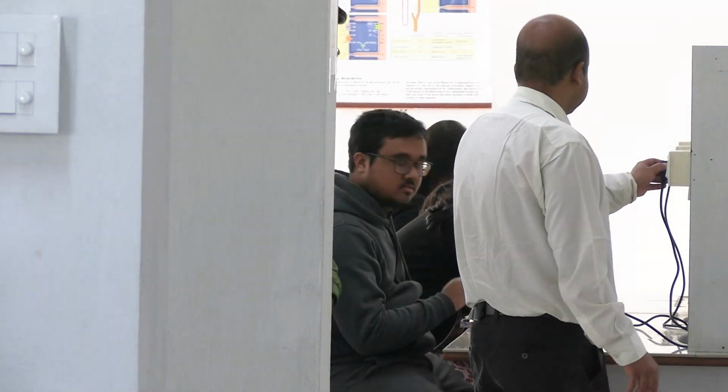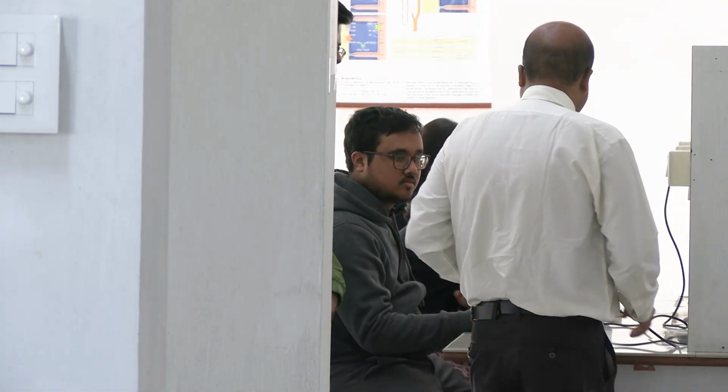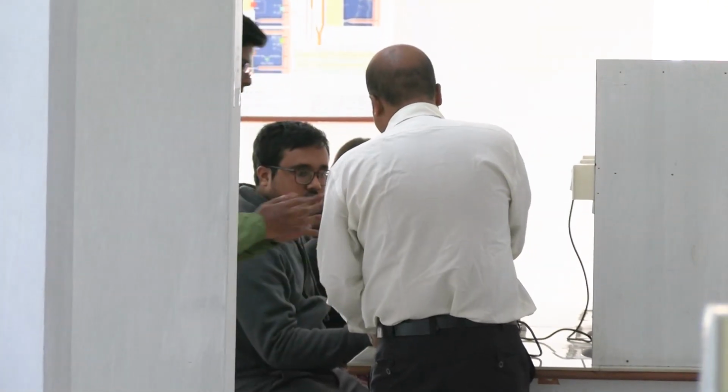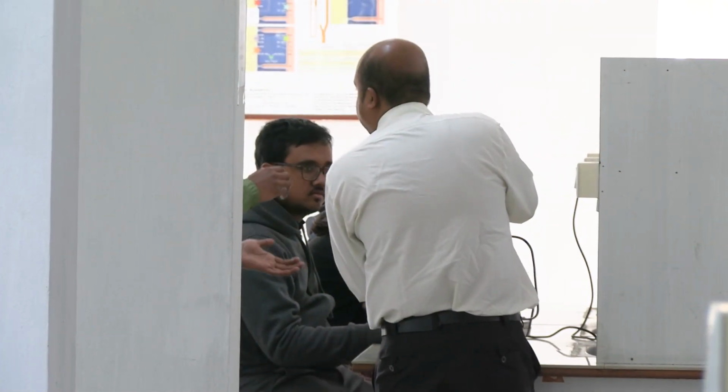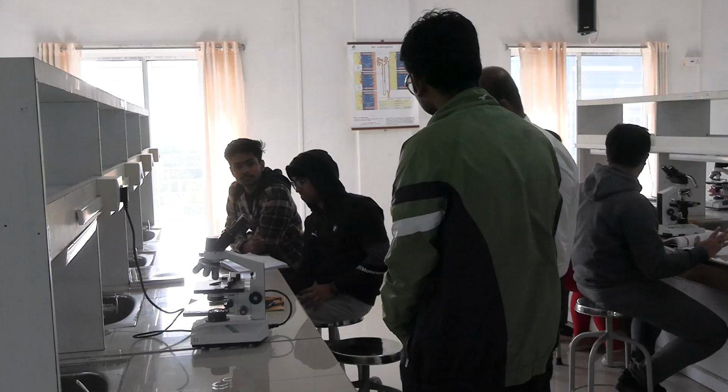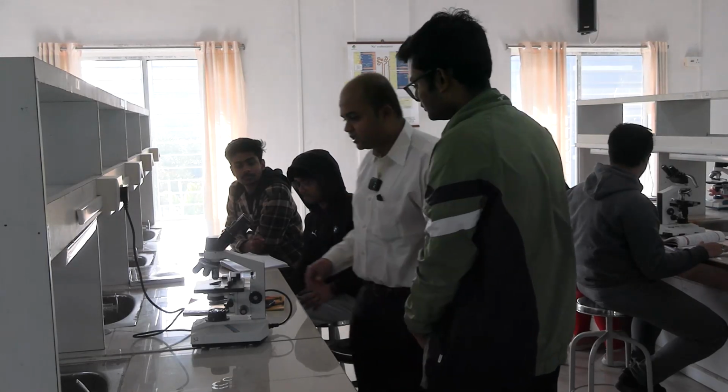Let's bring this to that table. Even this is to be learned, how to hold the microscope. Have you held the microscope before? It has to be held by supporting with your non-dominant hand. Usually the right hand is the dominant hand. Yours is the right hand, so you support the microscope with the left hand. We take these microscopes beside the window so that there is daylight. So this is the light source here.